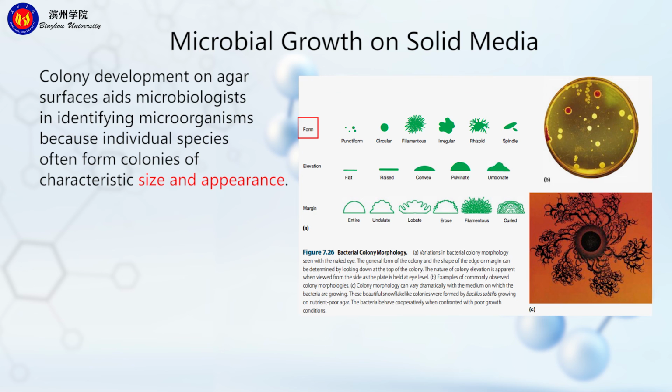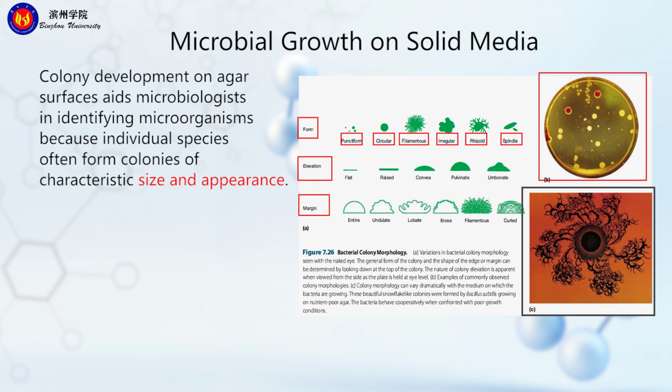They differ in their form, margin, and elevation. There are different forms. You can see the punctiform, circular, and filamentous forms. The margins are also different, and so is the elevation. There are many elevation types, such as flat, raised, and so on.